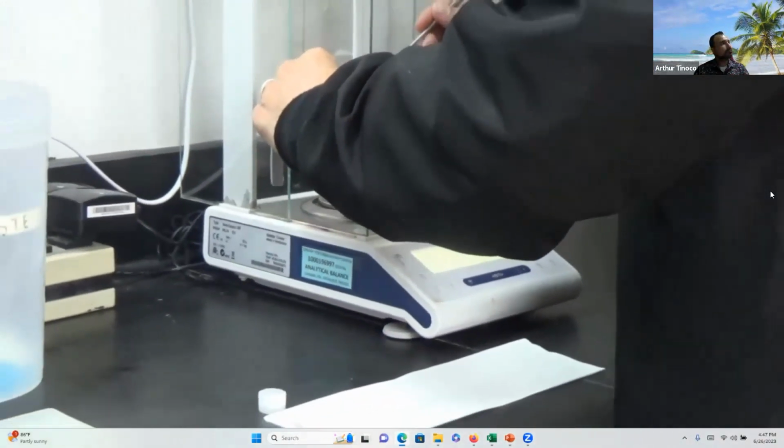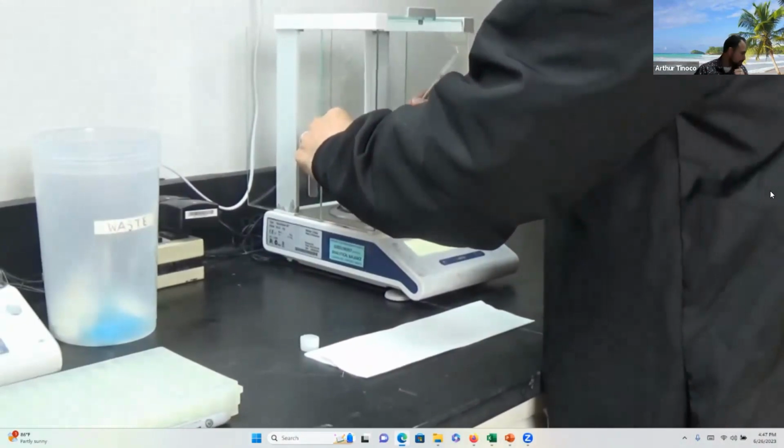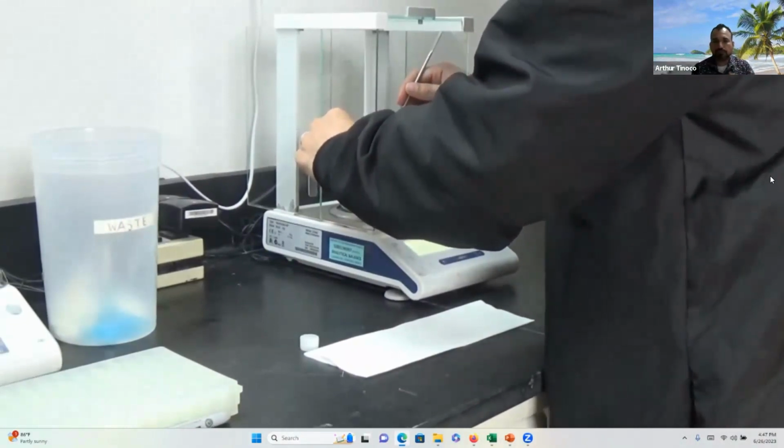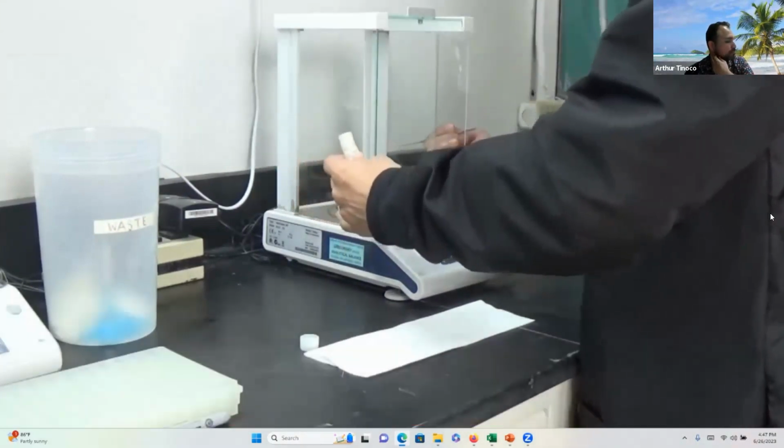So I weigh out the powder directly into the epi. Again, I'm aiming for a solution that is 5 milligrams per milliliter. And so I determine the volume that I will add based on the mass that I weigh out.